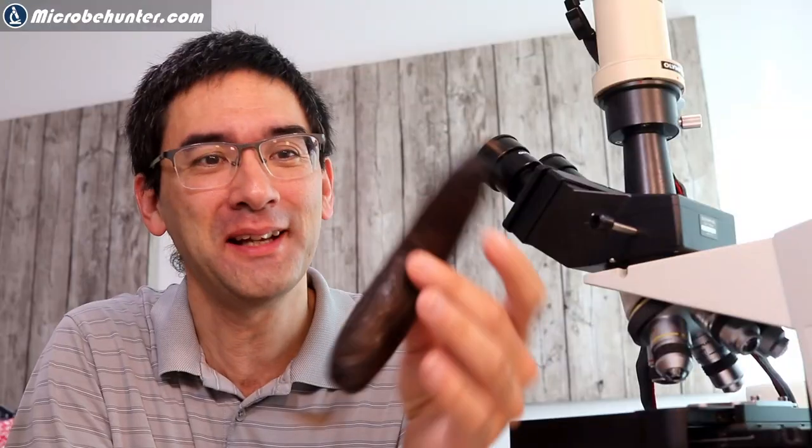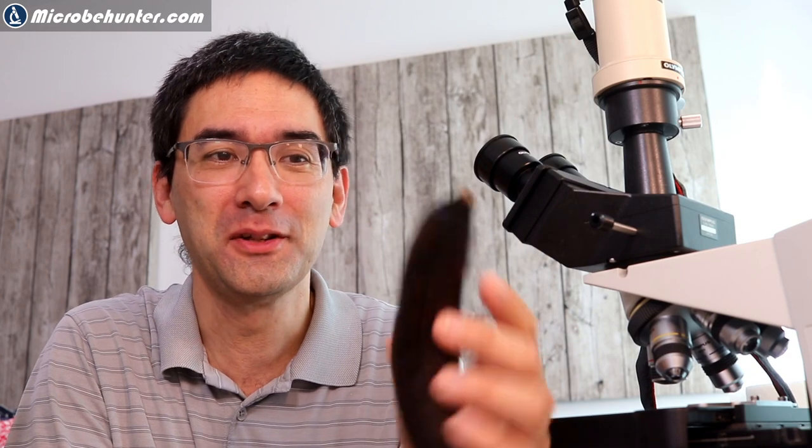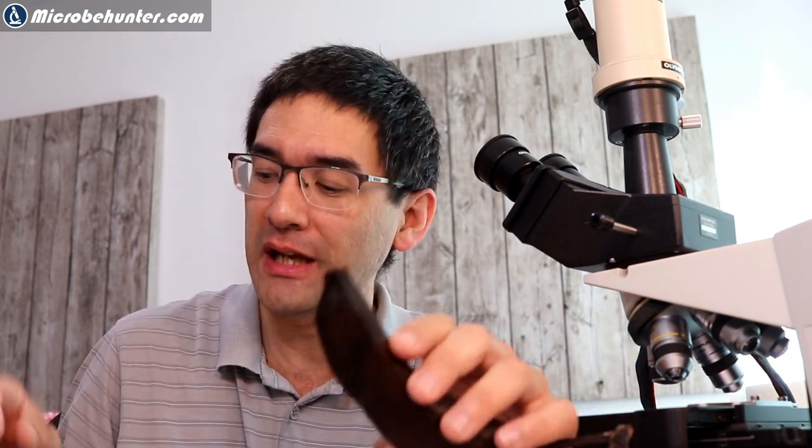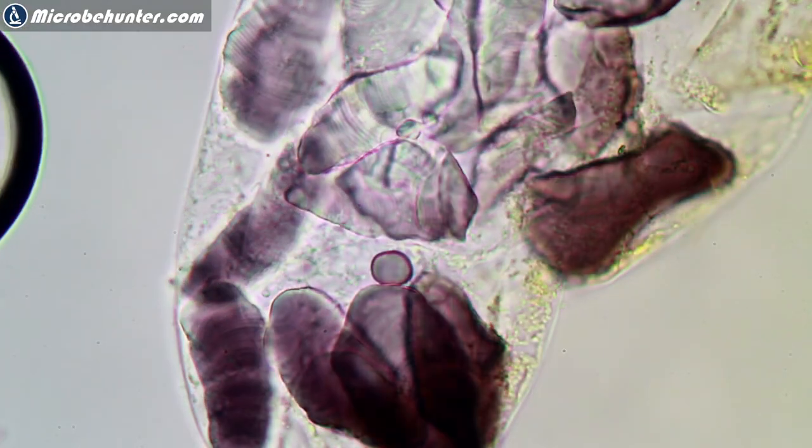This is a banana — it's very ripe. It doesn't matter if it's all black. Bananas contain starch grains, and what I'm going to do today is use an iodine solution that I bought to show you how the starch grains turn black when you add iodine to them. We're going to be observing this process directly under the microscope.